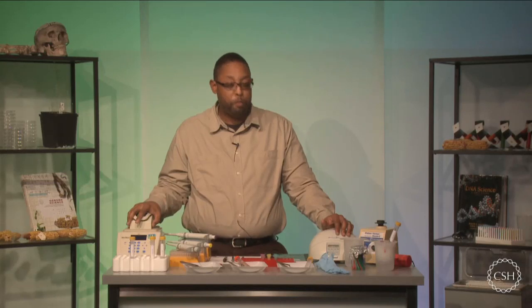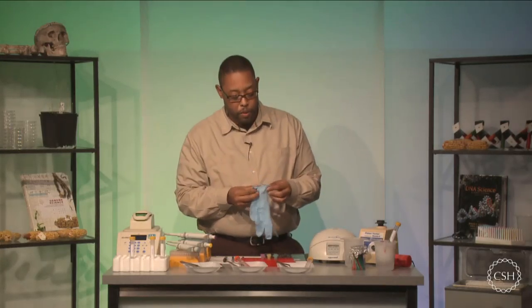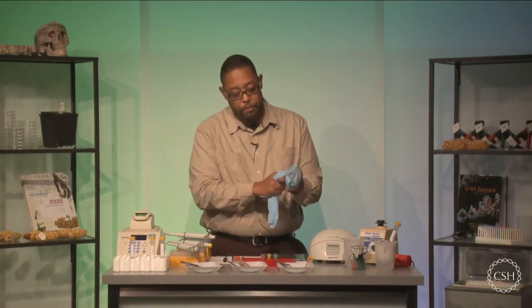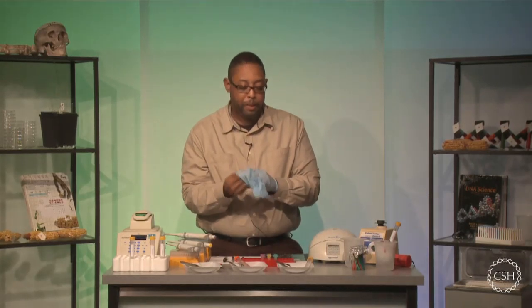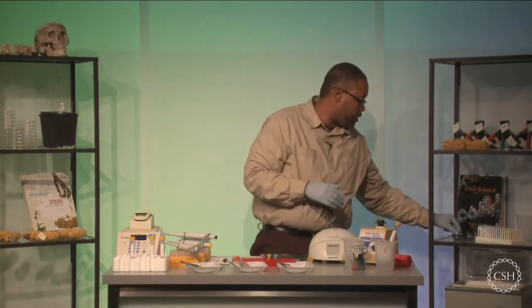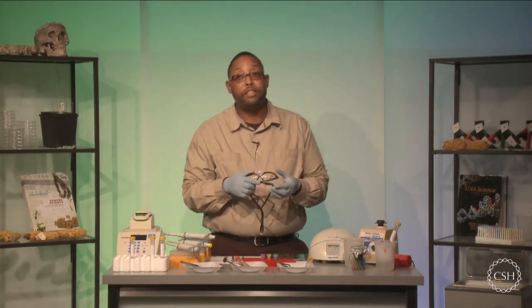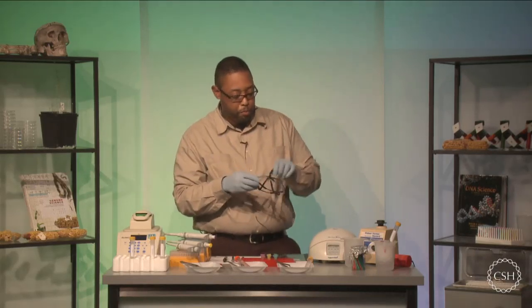One thing I do want to promote is safety in the laboratory. I recommend that you're going to need some gloves to wear, so I'm going to put these on. You should also be wearing some type of protective eyewear, whether it be glasses or lab goggles, but you need to make sure that you're wearing something protective over your eyes. Okay, I'm wearing my glasses, so I think I'll push on with that.